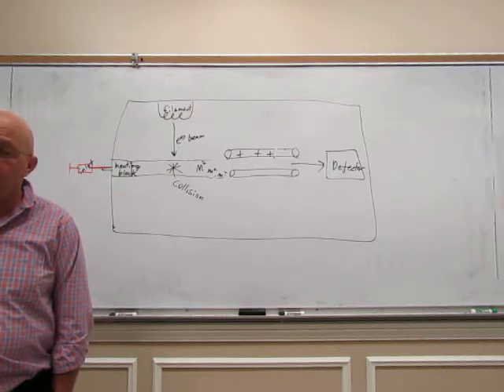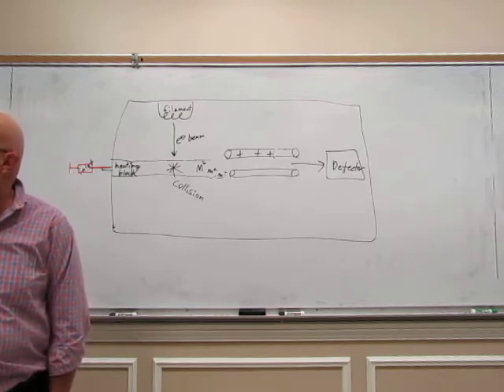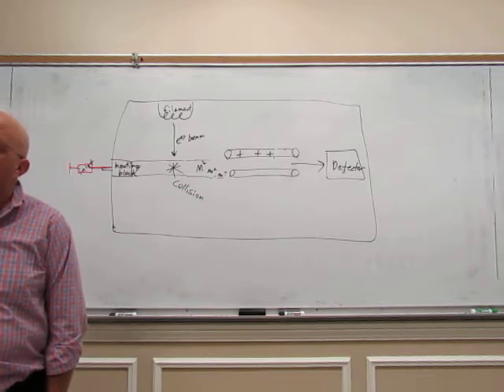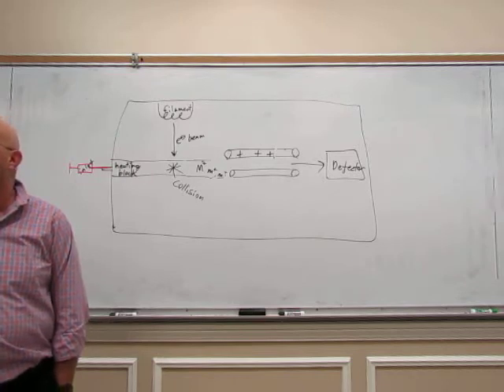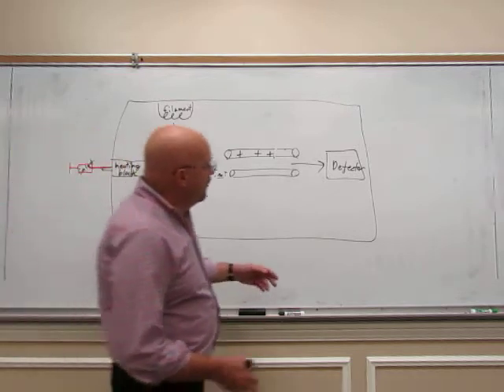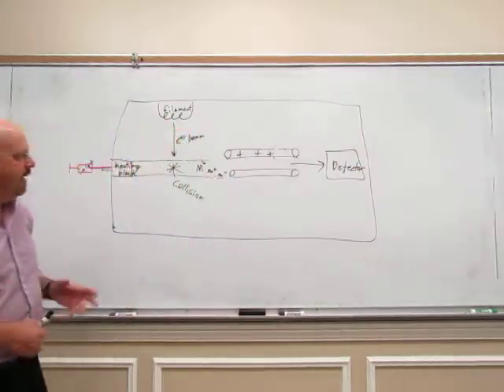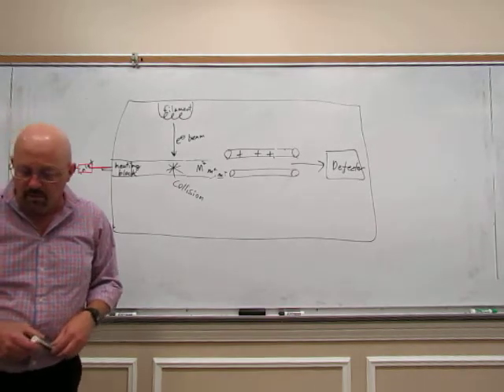The low-resolution mass spectrometer will give you the molecular weight. You'll still know your molecular weight. You just don't know the exact formula for your molecule. But you do know the molecular weight, and you'll know a few of the pieces of the structure. Now, all of this is hooked up to a computer, so your computer reads out a spectrum, and so that's kind of how the instrument works a little bit.